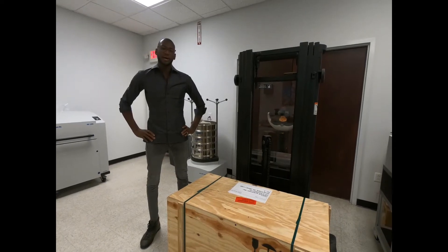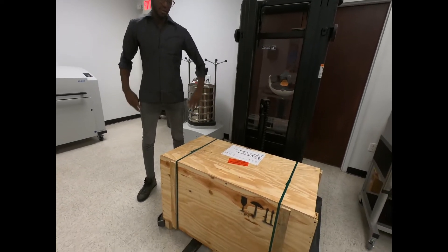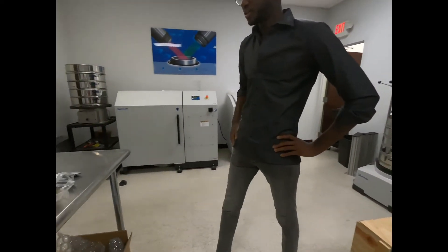Today I'm going to demonstrate how to unbox and set up your brand new TM200. This is how the unit is going to arrive on a pallet, and you'll need a few tools for the installation.